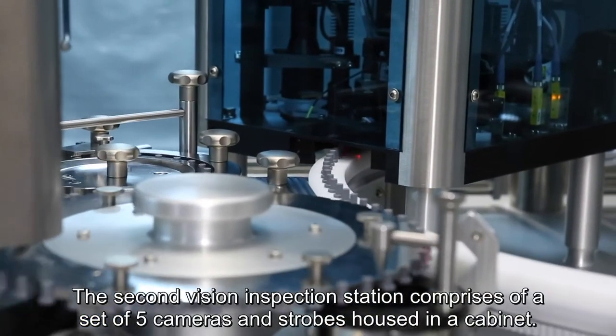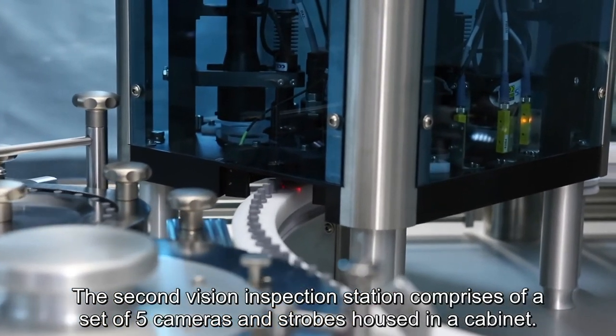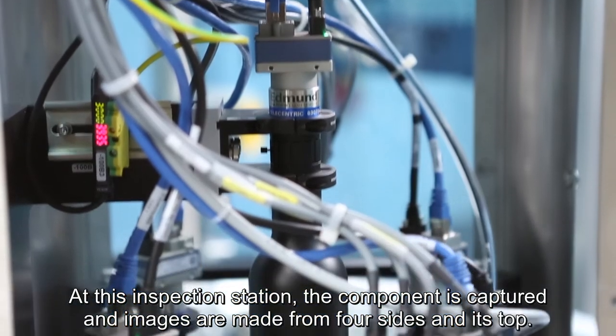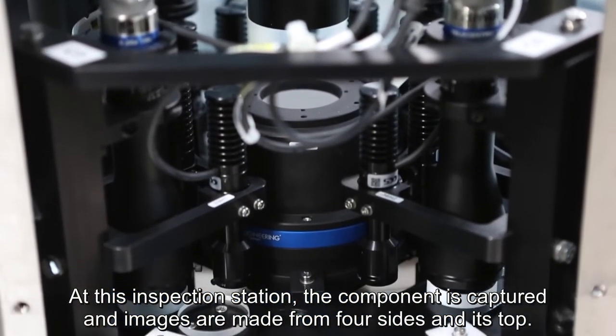The second vision inspection station comprises a set of five cameras and strobes housed in a cabinet. At this station, the component is captured and images are made from four sides and its top.